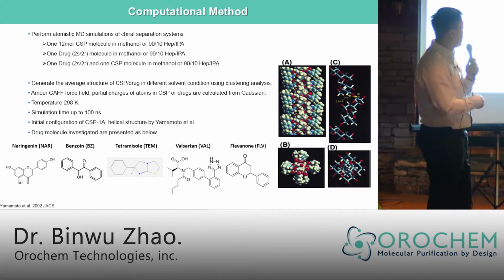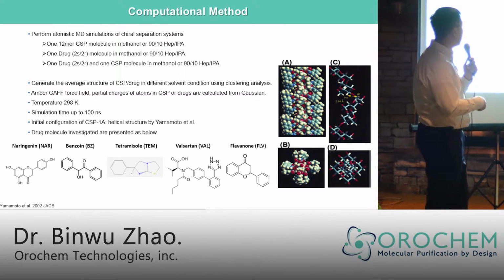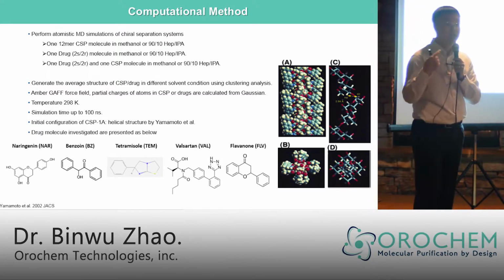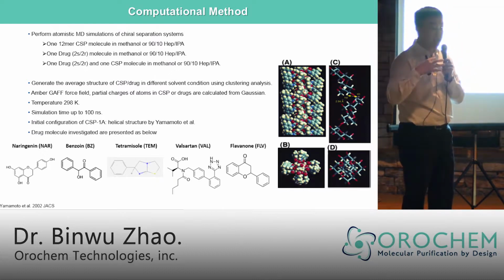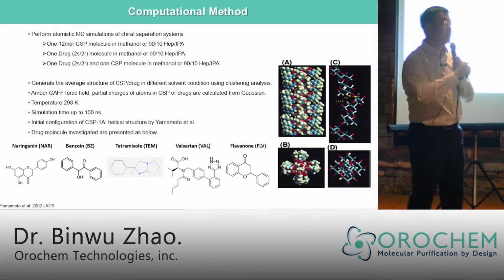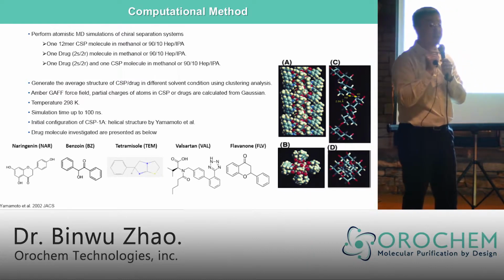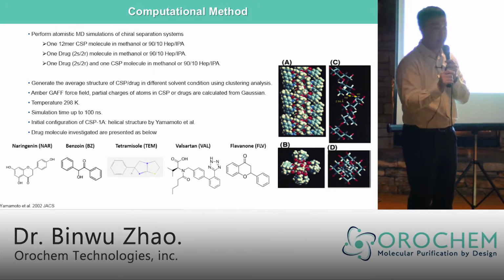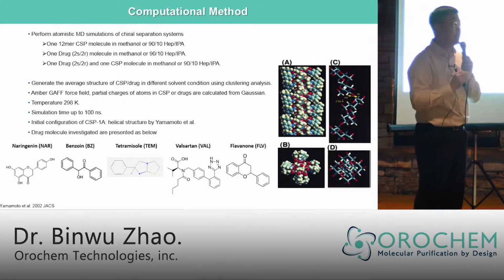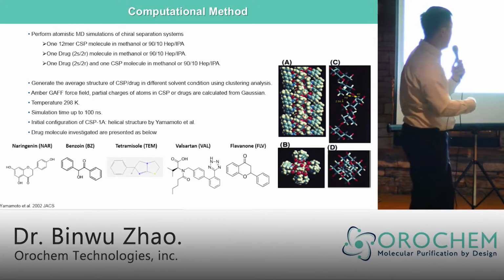Another computational study on this theme is using the docking method. So they look at the geometry of the CSP molecule. So basically look at the conformation of the CSP and see which cavity that the CSP has could have the drug fit in there perfectly. However, you're only considering a fixed conformation of the chiral stationary phase, and you are losing the dynamic behavior and the interaction between the drug and the CSP in this case.